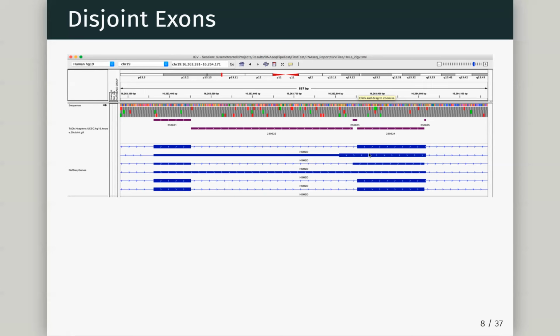We seem to have a little bit of an exon sticking out for this transcript here. It's hard to tell at my angle. But if we want to represent that, we also need another exon part, and that represents any, I guess, signal which comes from either of these exons. And then finally, you have this exon. And then, if you look very carefully, this exon stops a little short, which means we have this exon.